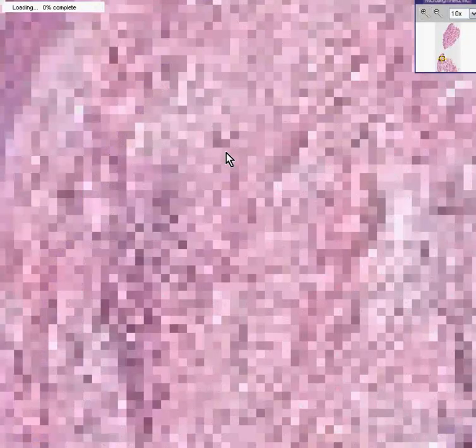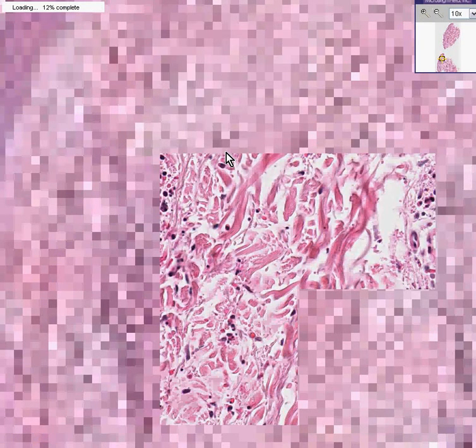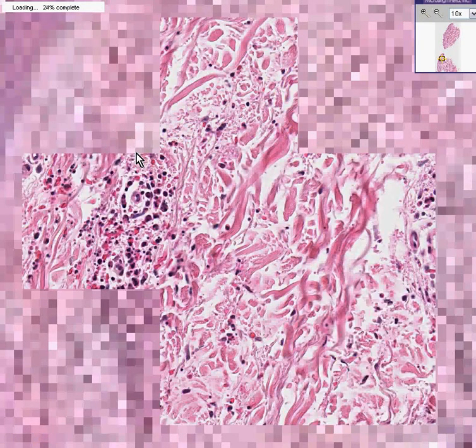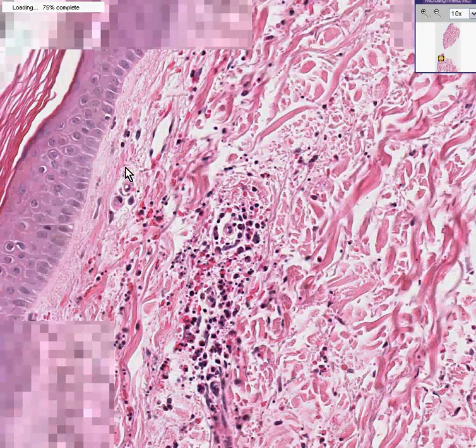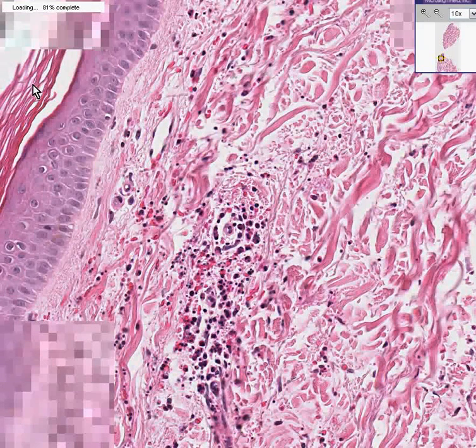The epidermis doesn't look terribly bad — this is a normal epidermis.